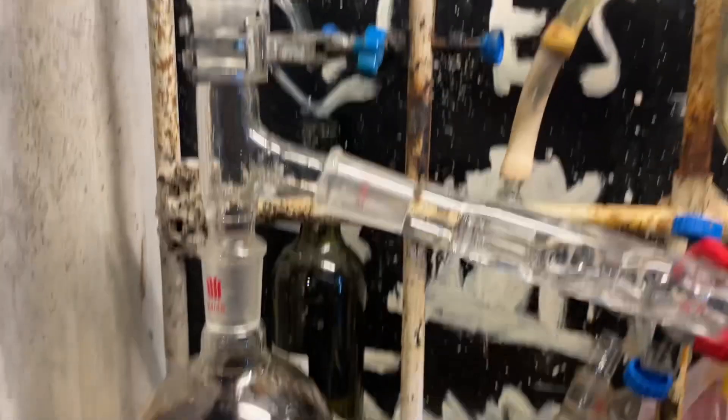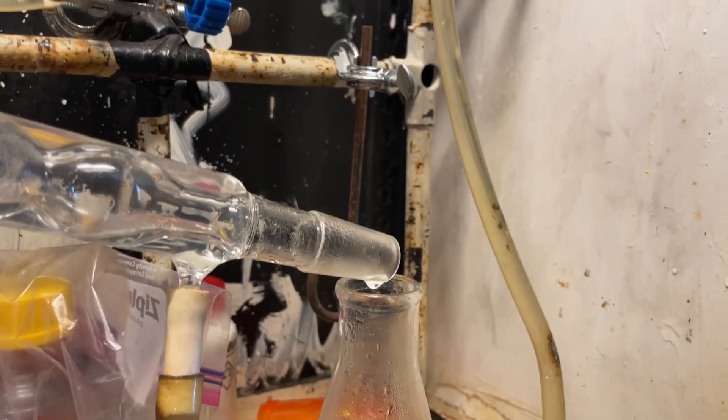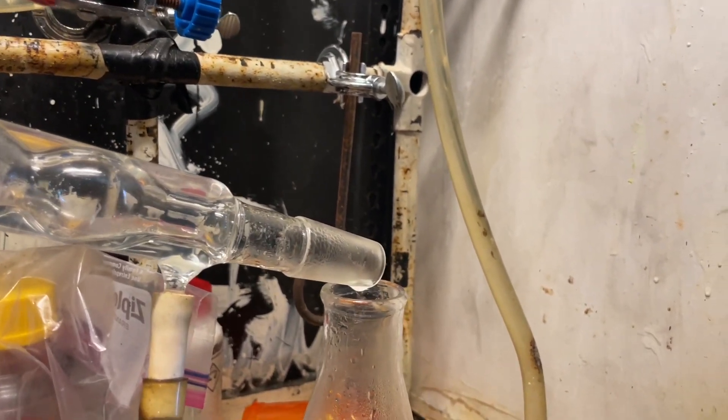I've added all the water in the funnel and let it boil down a little more, and you can see we're no longer getting a milky colored distillate — we're getting a clear liquid. It has a slight smell of nitrobenzene, but oh well.